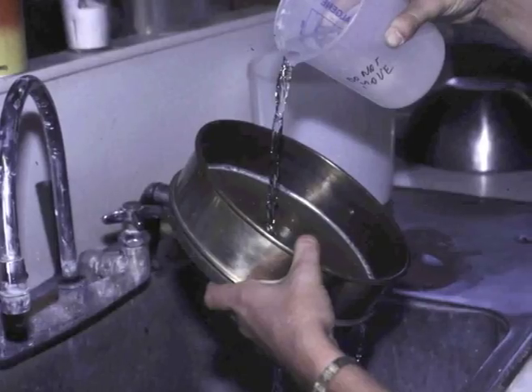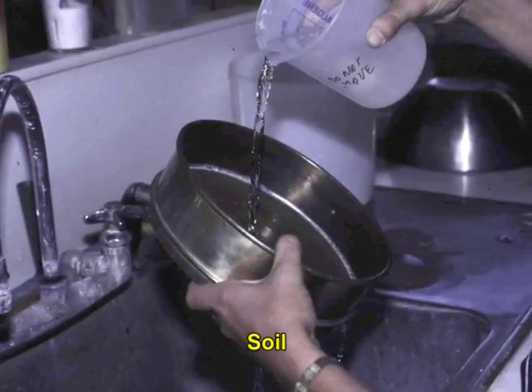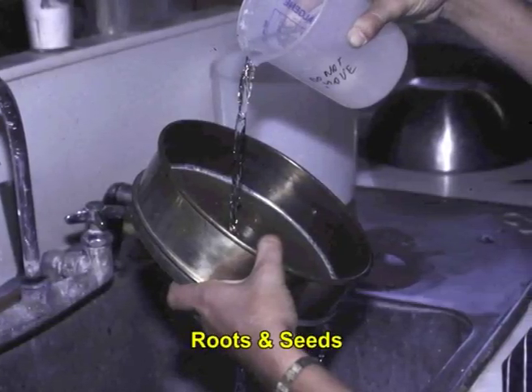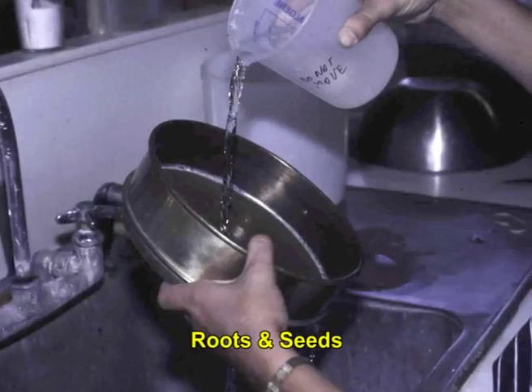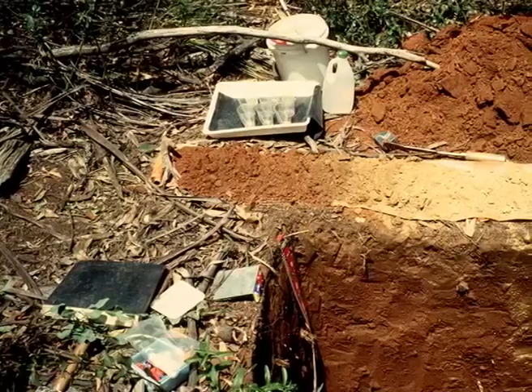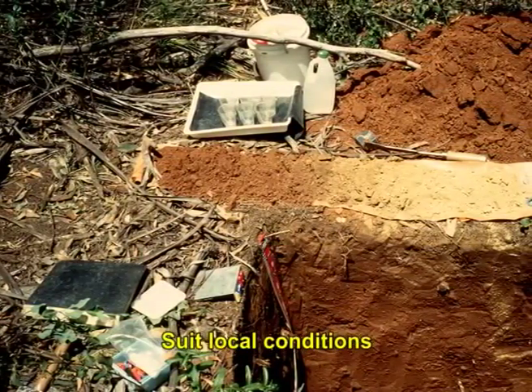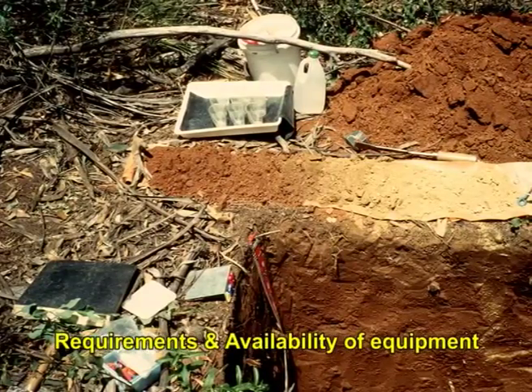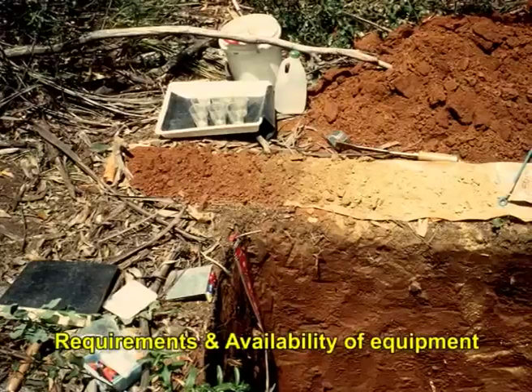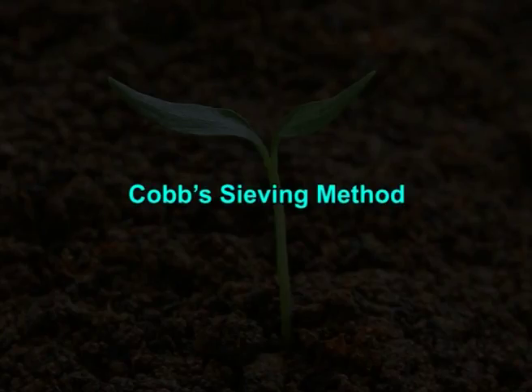Some are efficient for extraction of nematodes from soil, while others work best for extraction from roots and seeds. Some others are specialized for nursery stock inspection. Some are partially used, others have been adapted to suit local conditions and requirements and availability of equipment. Some of the commonly employed nematode extraction methods are the Cobb's sieving method.